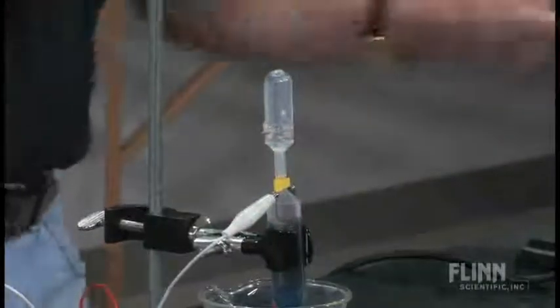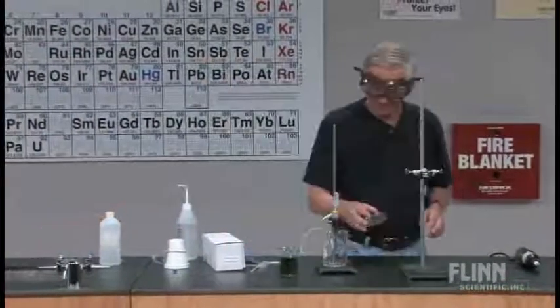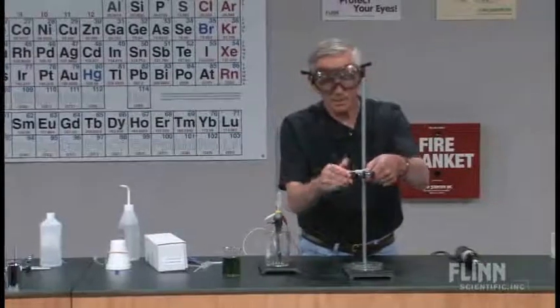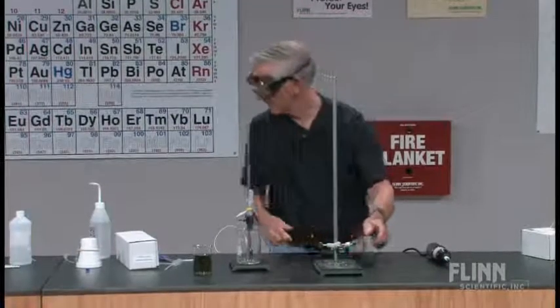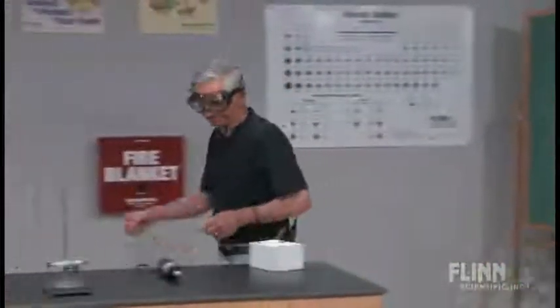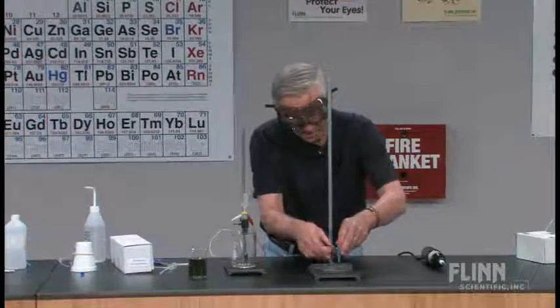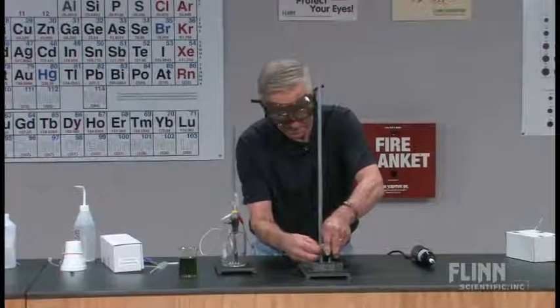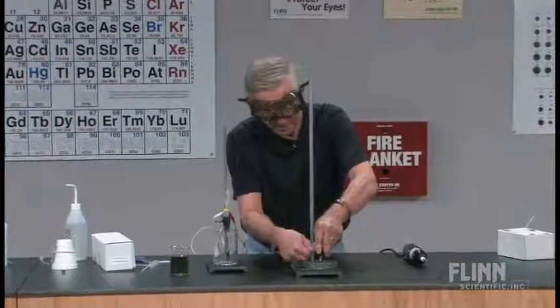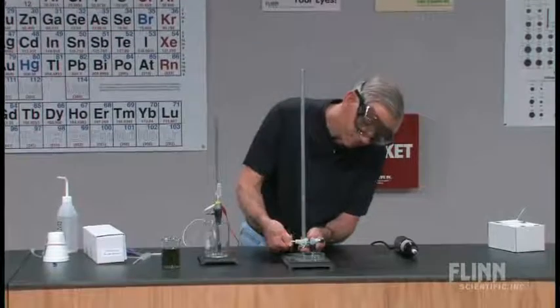We'll set this aside and bring this out. This time, it's going to be a little bit different. Not a lot, just enough. And I'm going to use this as a gauge. Because when that's ready, I'm going to clamp it in here, mouth down, underwater.